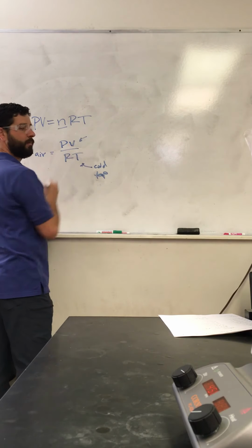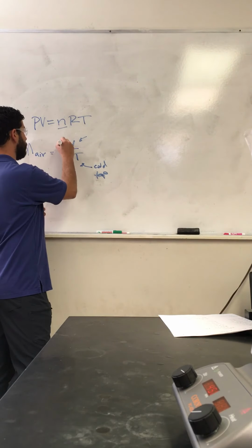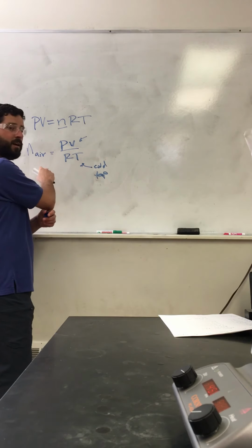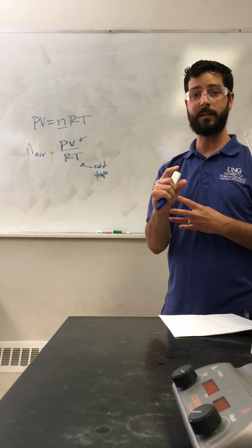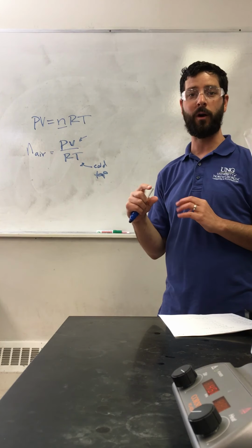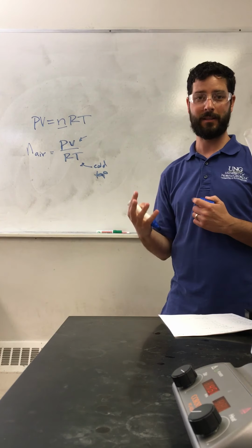We're going to use the cold temperature, and we're going to use our volume from that 5 °C measurement. We're going to use our pressure as the barometric pressure that we talked about earlier, and we of course have our gas constant. That's going to give us the number of moles of just air inside that bubble. Again, the bubble when you heat is going to turn into air plus water vapor, and so we have to get this to be able to subtract it out to account for the amount of volume that's due to just air that we don't really care about in this experiment.